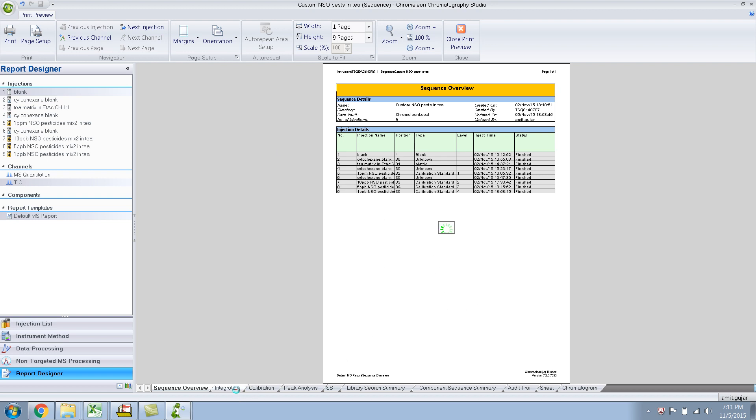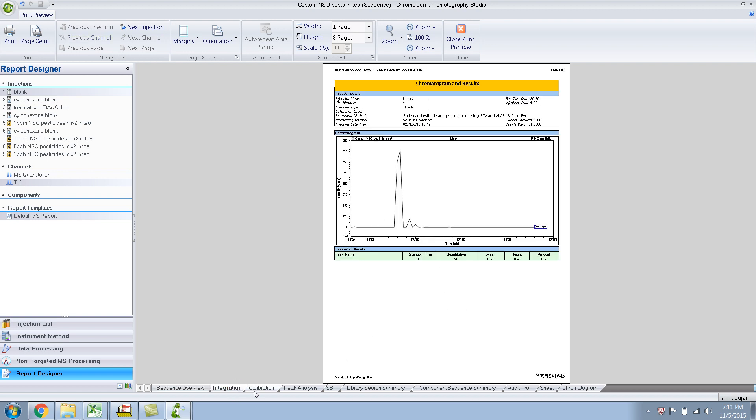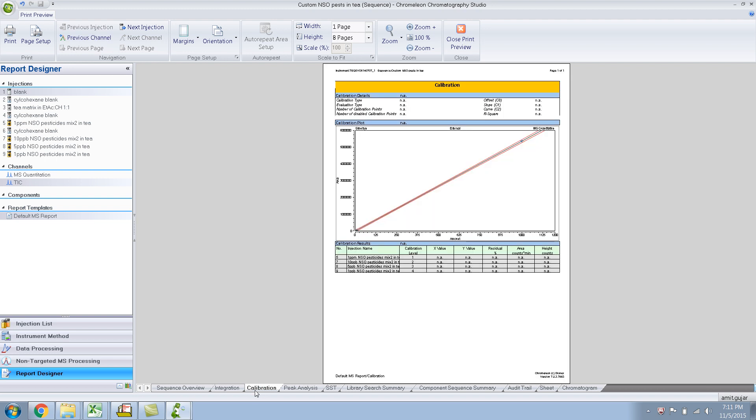So as a follow-up question, they asked me, can we put our own watermark, your company logo or anything, any watermark. And the answer is right now, you can't, at least in the version I have. The version I have is Chromalian 7.2 SR3. But maybe in the future, that might be a possibility.